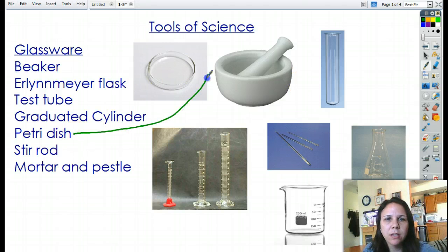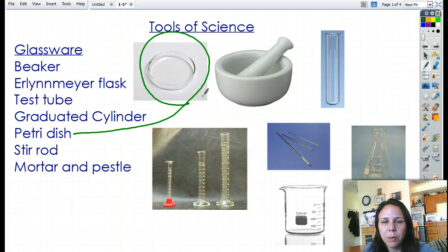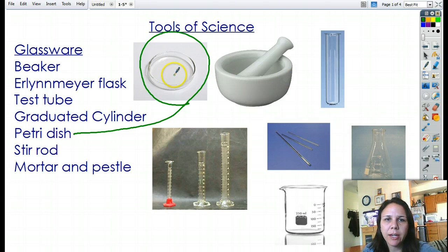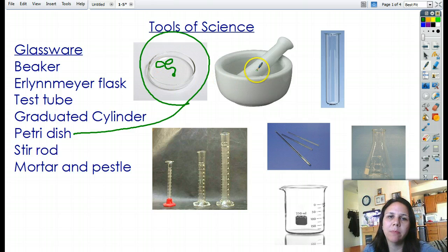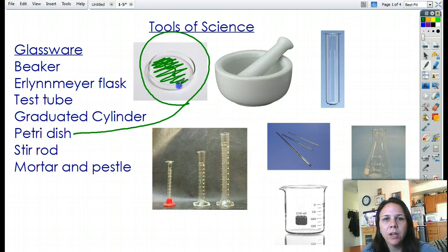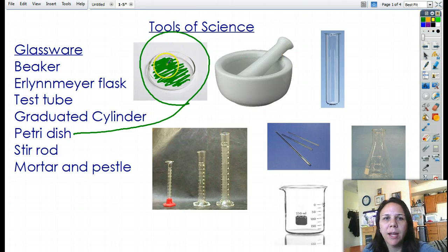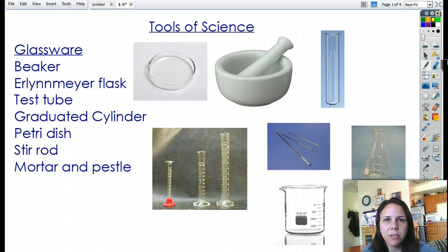Petri dishes come in either glass or plastic, depending on what we're going to be doing with them. They're good for little small scale experiments — I could put a pea in here and watch it grow. The main thing you probably see them for is growing bacteria. You'll see a thin layer of something called agar, which is food for the bacteria and a place for them to grow, and then little colonies of bacteria start to form on top.